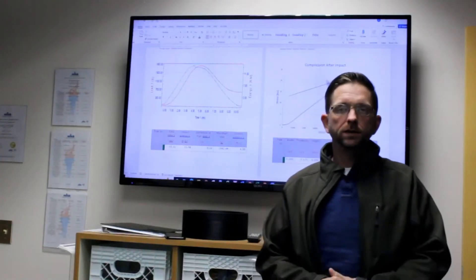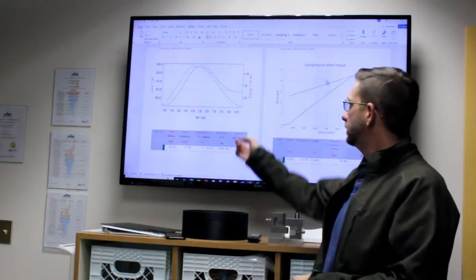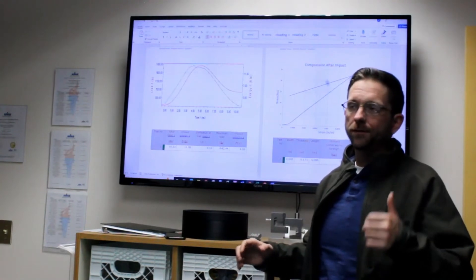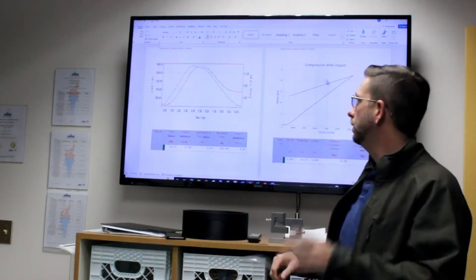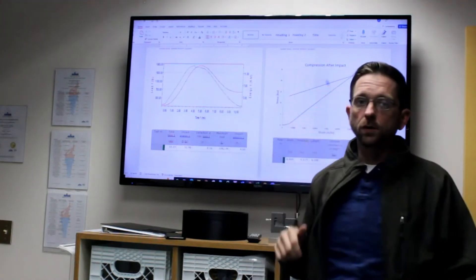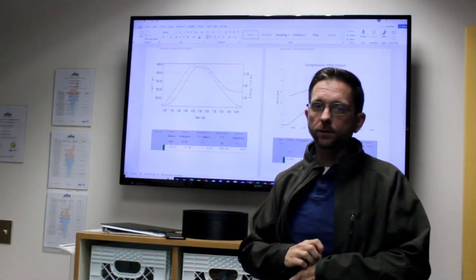There you have it — our presentation on compression after impact testing on fiber reinforced polymers. We're going to show you how we would present some of these results to the customer. Here we've got our impact test graph. We show in the red line our energy — the theoretical energy — and this is based on theoretical calculations: mgh and mv² over two. The output energy matches what we were shooting for. The other line shows how the load increased and decreased, and as you can see this is over a very short span of time — about 10 milliseconds — so a very high frequency of data collection.